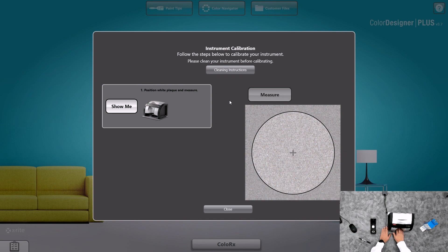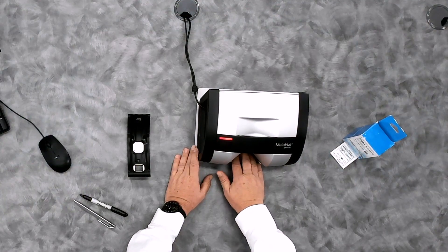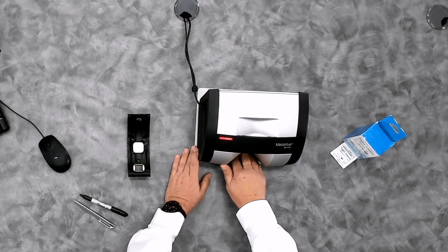On the instrument, it has a slider rail down at the bottom. It also has a grasp that you can grab the instrument with. Never use your finger to pull the calibration plaque forward. Always use the clasp in the front.